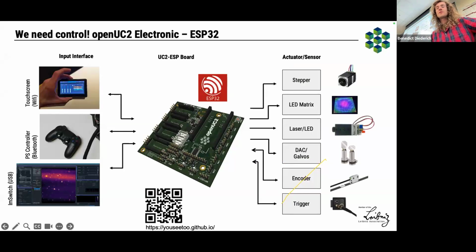I don't want to overwhelm you with too much technical stuff. Maybe we can also go into the details, like what I have here, and then discuss a bit more. Some closing remarks. All the optics also need control. The way we did it, they're also open source. We have a little board with fully modular control of all kinds of different elements like motors, lasers, galvanometers, stuff. And this is, I think, a good example to show that it's actually working.